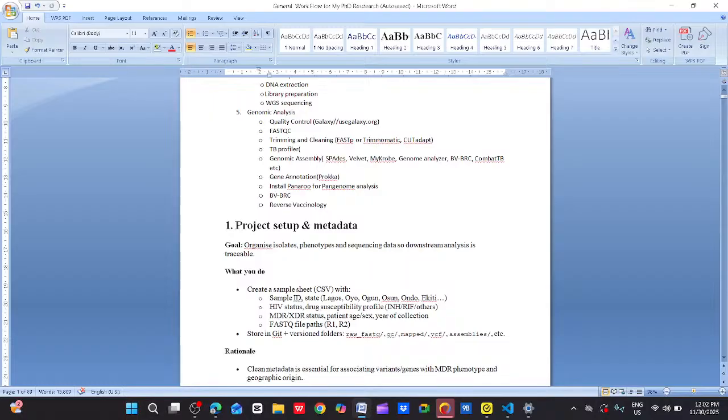So it will divide it into three. The first one is the core. If we have four strains, the core is going to be the intersection of the four strains. When you have it in more than one of the strains, you talk about it as an accessory. And if you have it in only one strain, it will be regarded as unique, very unique.